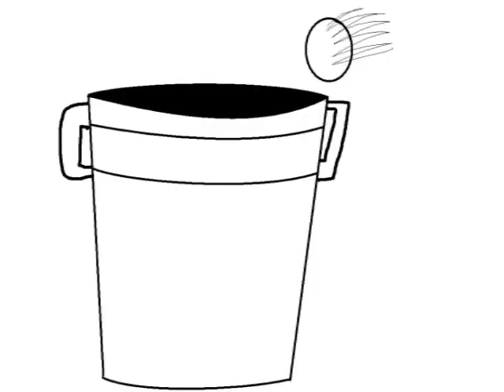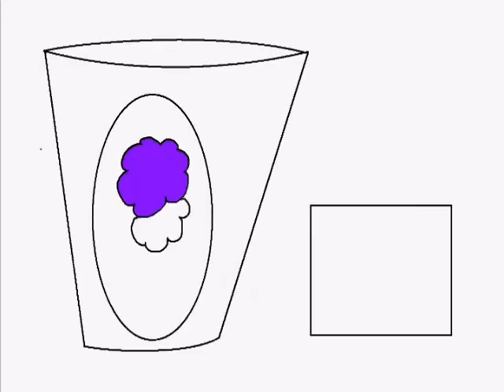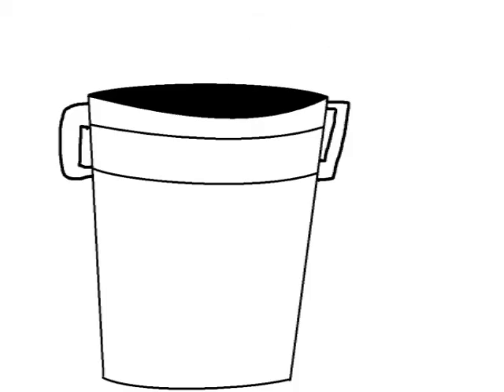Day 3. Measure volume and dispose of egg. Repeat steps 1 through 6 of the day 1 procedure. Draw and record data. Dispose of egg.